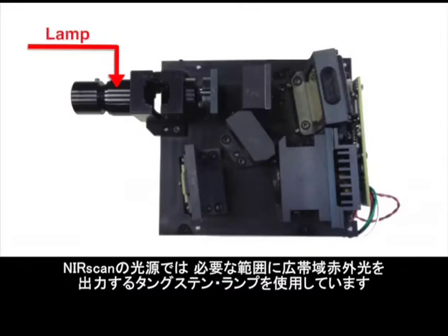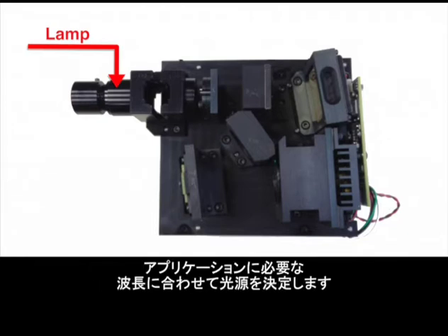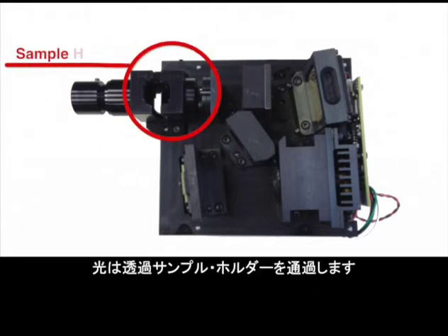We start with the light source of the NIRscan, which utilizes a tungsten lamp that outputs a broadband infrared light in the desired region. The wavelengths needed for your application will determine your light source. The light then passes through the transmittance sample holder.